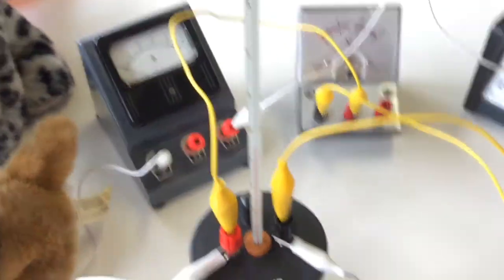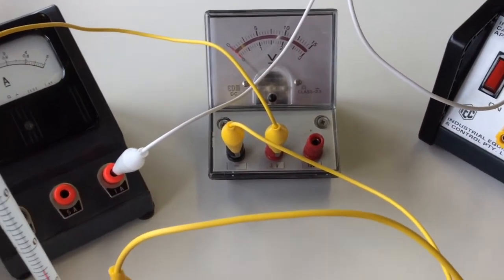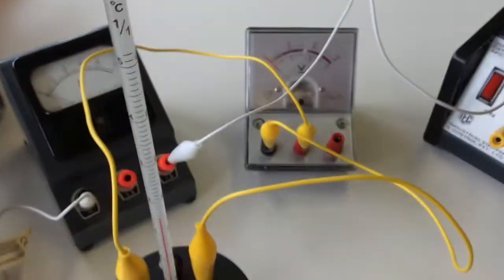So our ammeter is in series. Our voltmeter, if you look at the diagram, needs to be in parallel. It needs to be reading the voltage that is across the calorimeter. So each is the yellow alligator clips, and it's in parallel.